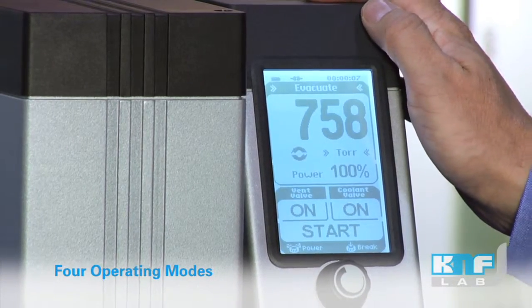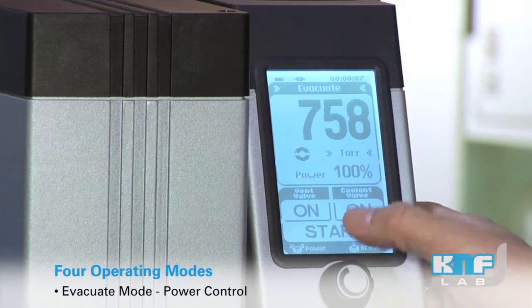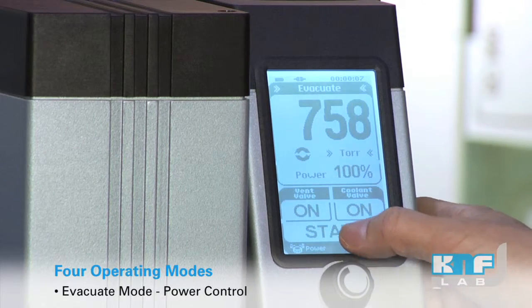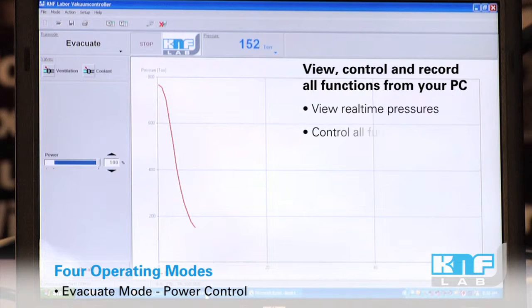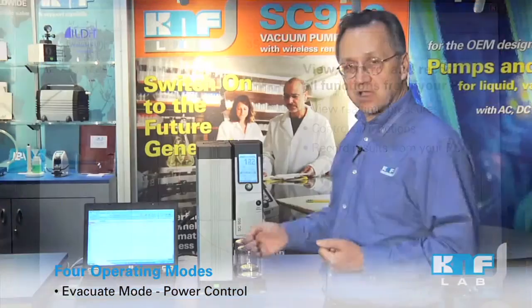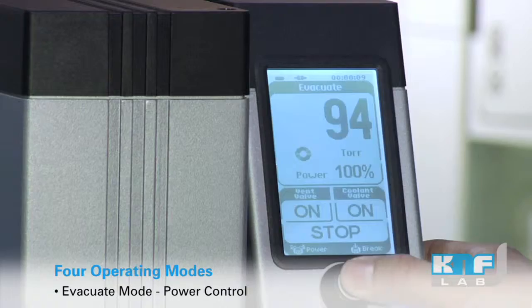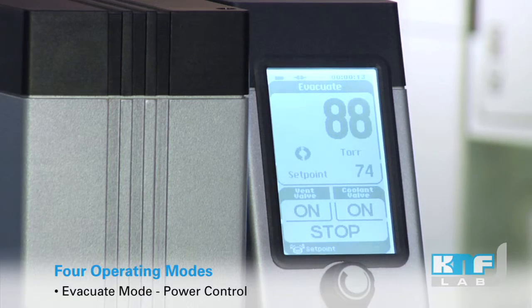We have four operating modes that you can choose from. The evacuate mode, which we see now, enables you to adjust the power of the pump. We can start at 100% power to pull down quickly, and as we near our desired end point or as we start to see the evaporation begin, we can stop it and then tune into a specific end point that we desire.